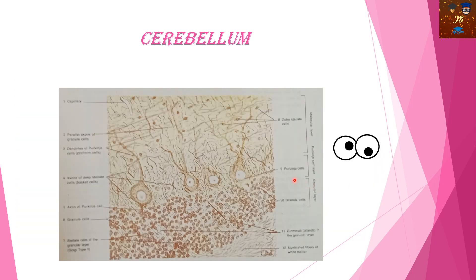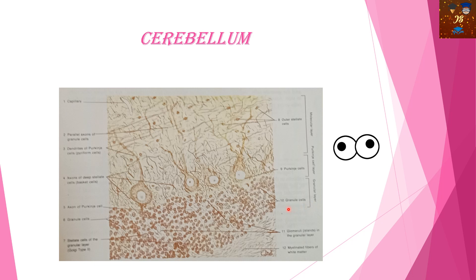Here is how the Purkinje cells look — you can surely identify them under the high power objective of the microscope. These are the granule cells, which have close association with the Purkinje cells. These are the outer stellate cells in the molecular layer. The middle layer is the Purkinje cell layer, and the innermost is the granular layer containing the granule cells — this is one fold.